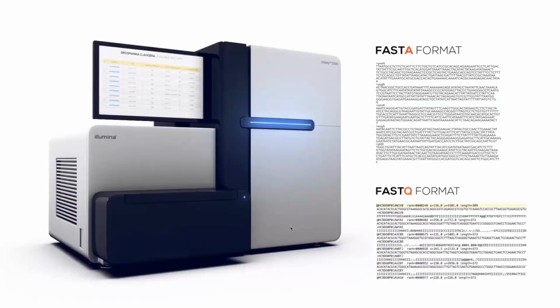So the FASTA format is simply sequences, raw sequences of reads that are produced through next generation sequencing technology. Those will be short reads, as you can see right here, short sequences that range anywhere between 35 and 215 base pairs in length. As they come, for example, in a reference genome, it could be a complete long sequence, or it could be short sequence reads, just like you see right here.